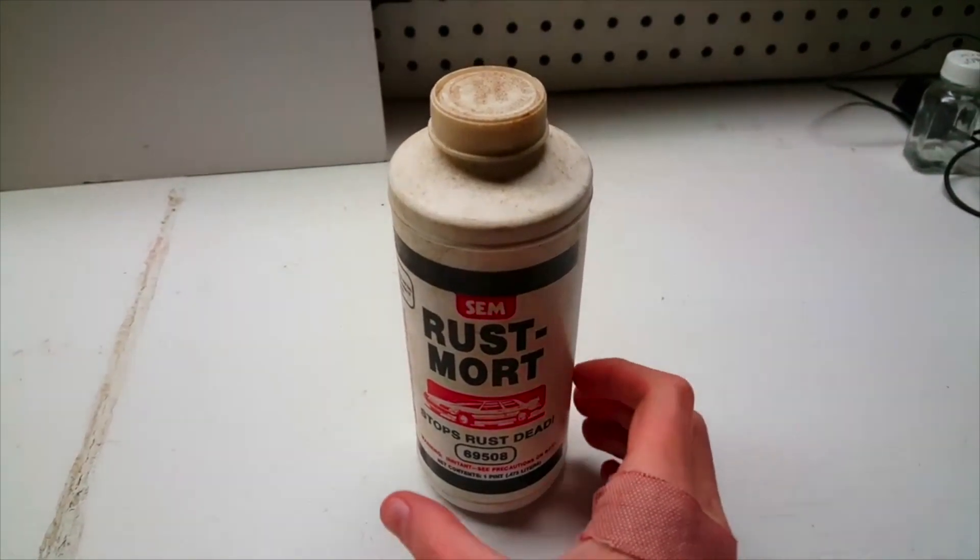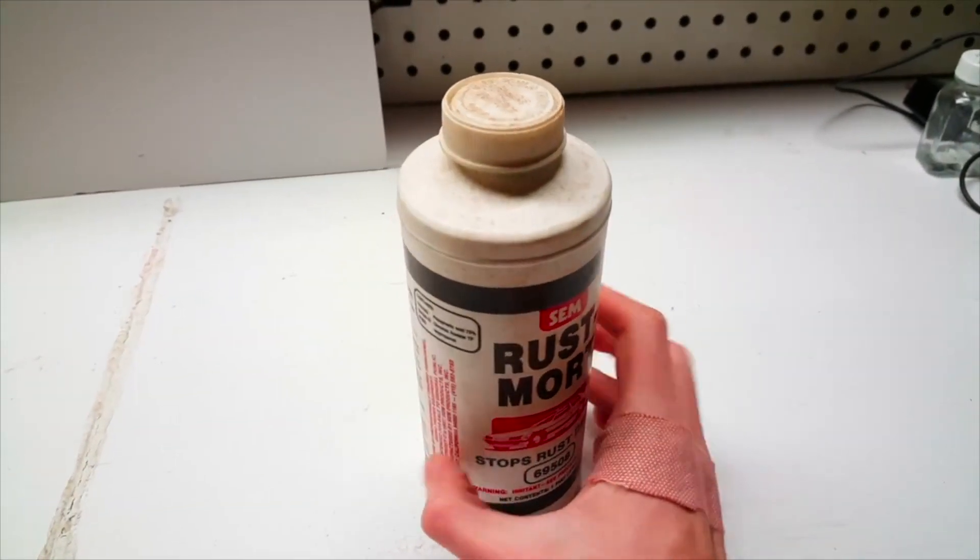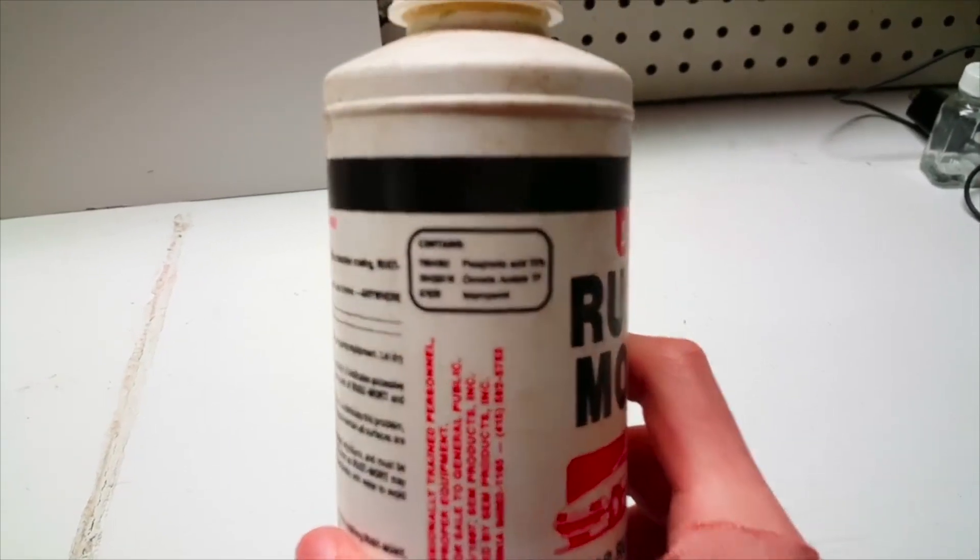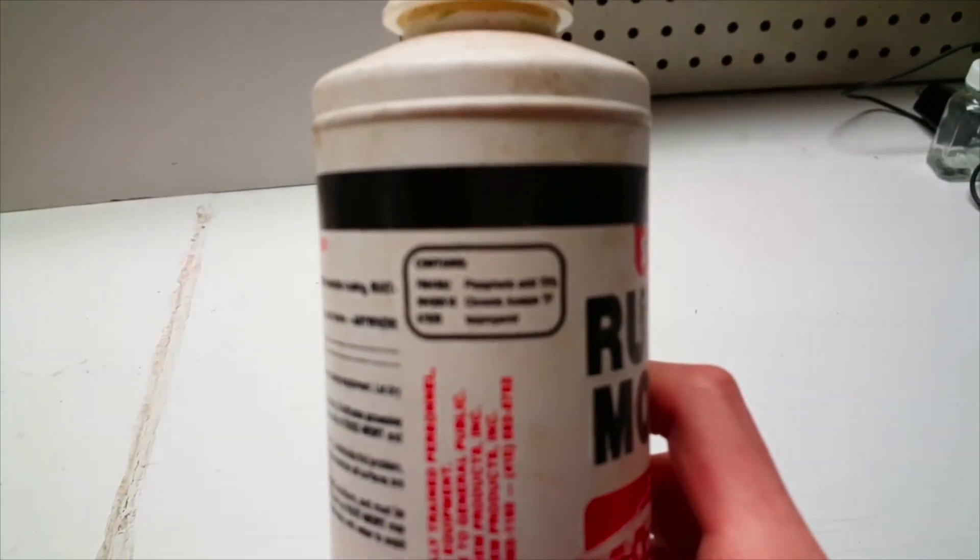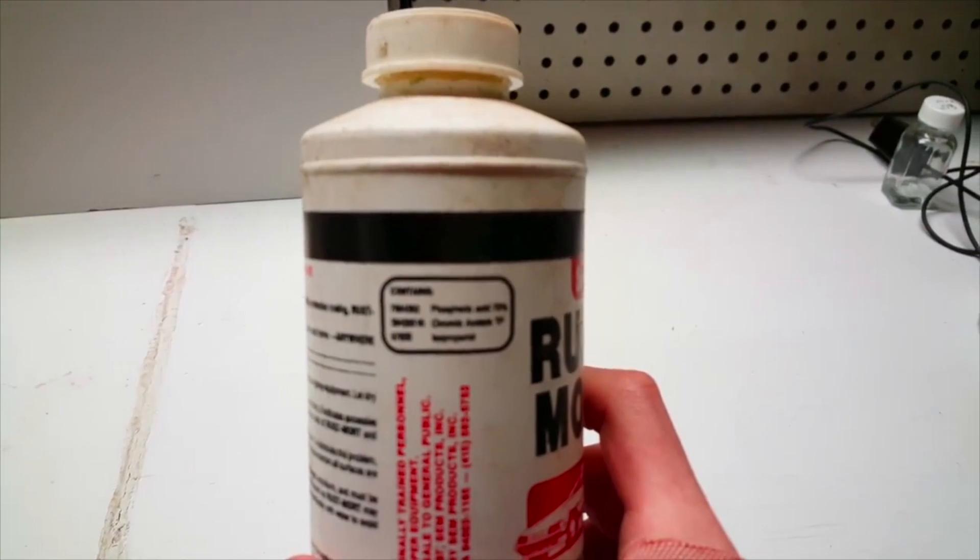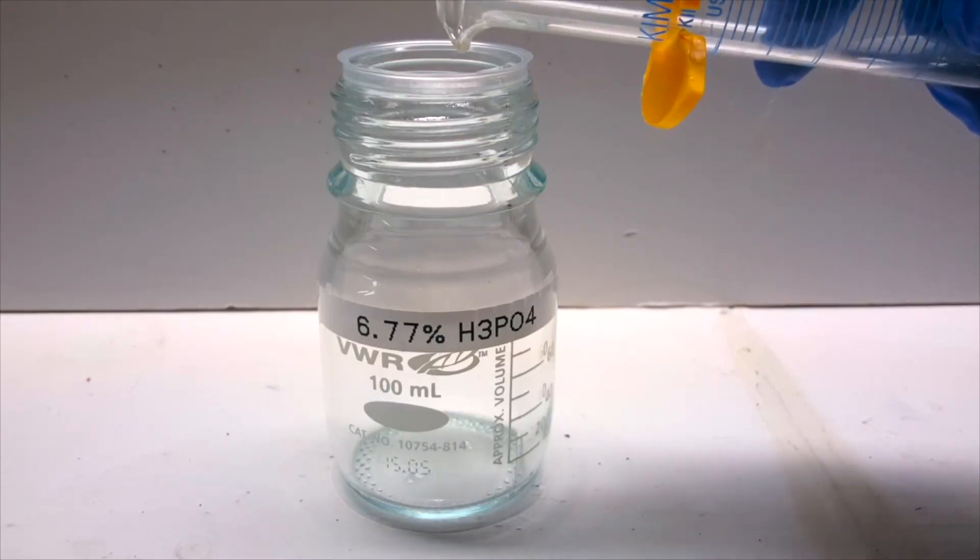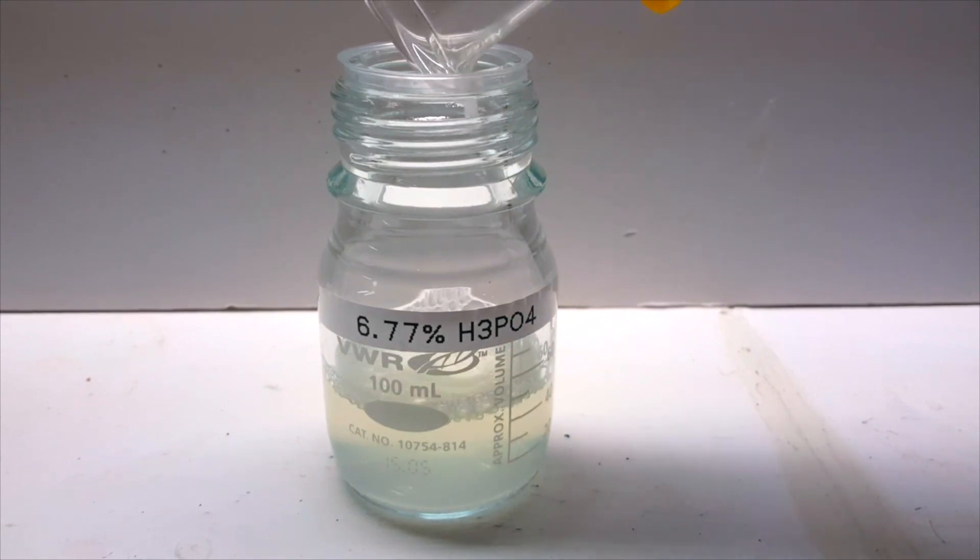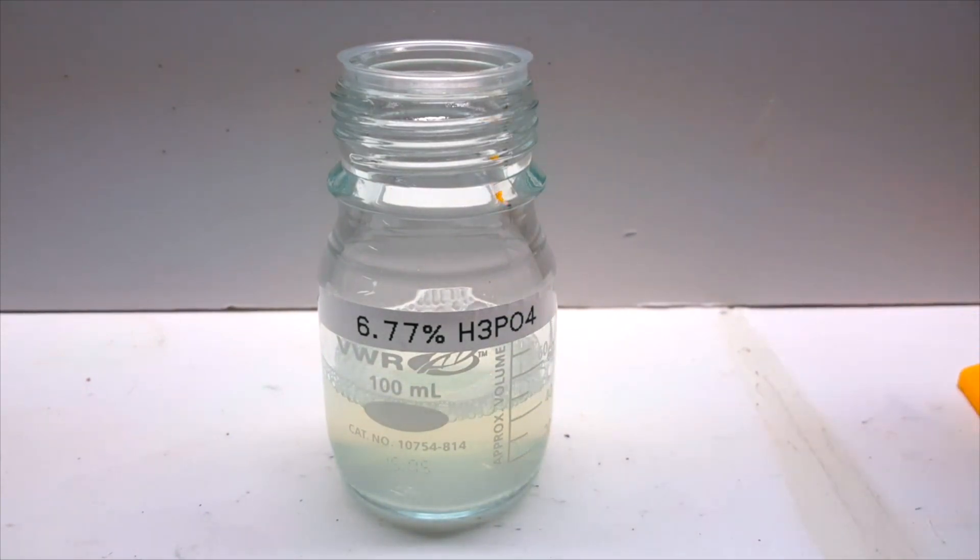In a previous video, I extracted phosphoric acid from an old rust remover. It was contaminated with what appeared to be some chromium-3 salts, so I attempted to distill to get a higher concentration of the acid. In the end, I only collected 47ml of a cloudy 6.77% acid, which is a pretty pitiful yield.